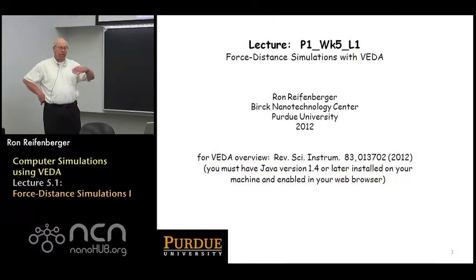If you have not yet installed or accessed VEDA, I'll just remind you that you're going to need to download the Java program 1.4 or higher. There's a direct link from the VEDA web page to the Java website, which will allow you to download that software at no cost. So that has to be installed before you actually try to use the VEDA simulation.